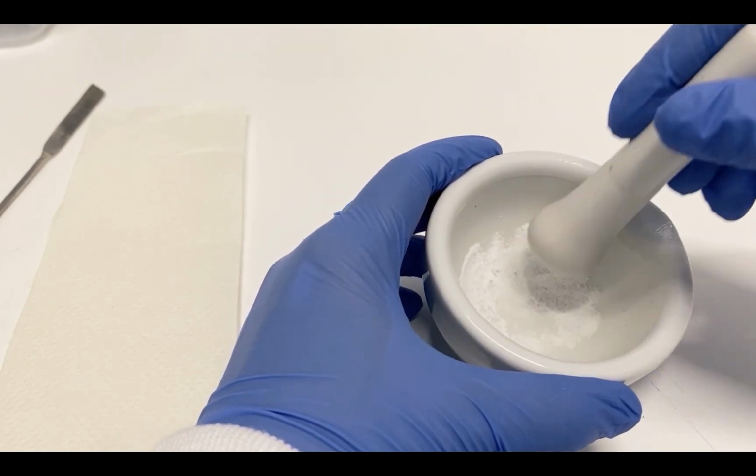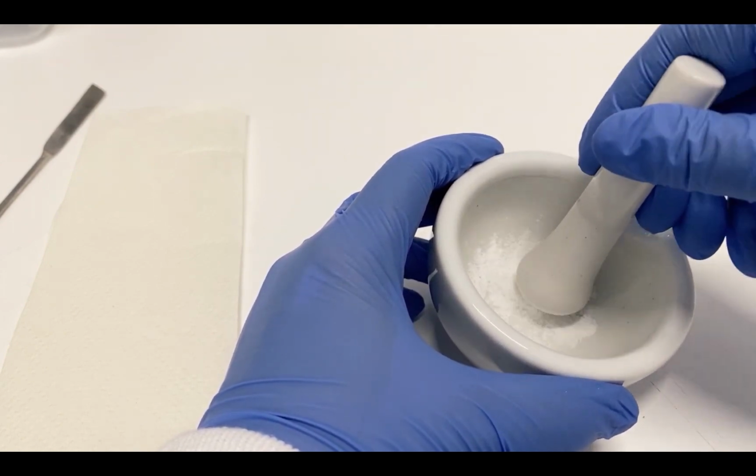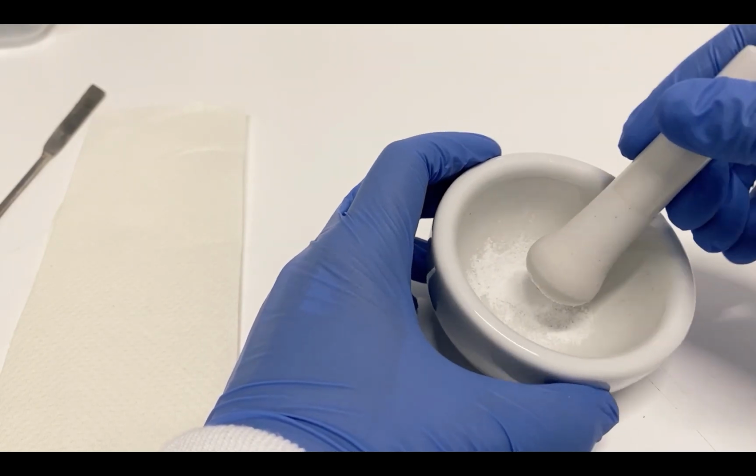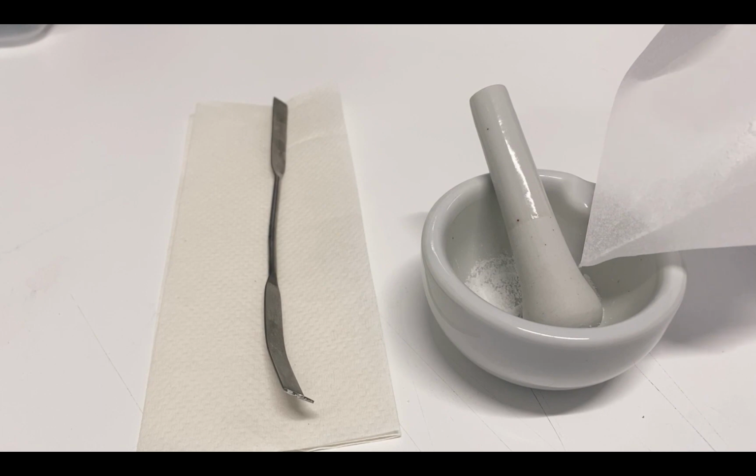Collect the powder at the center of the mortar before adding an amount of the remaining solid. Add the remaining powder and repeat the triturating process.